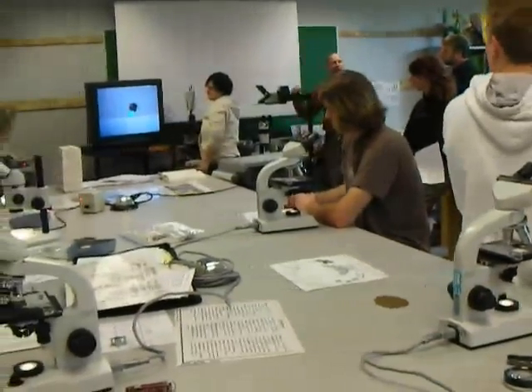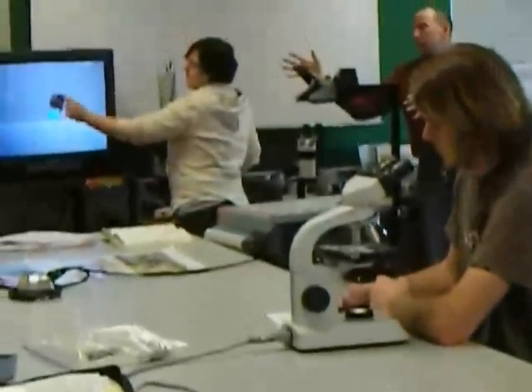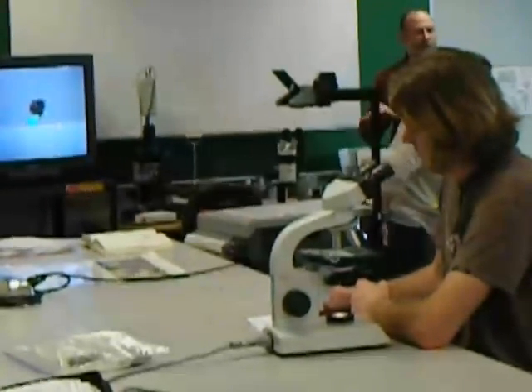So you might think that this is not a successful thing because it looks sloppy. It's great — she's got all the information she needs on this slide. This is the area you want to look at, and then you can see right here — what did you call them, the shoulders?